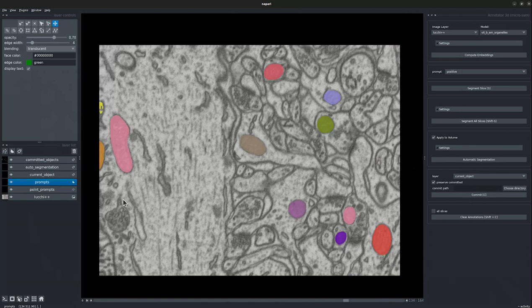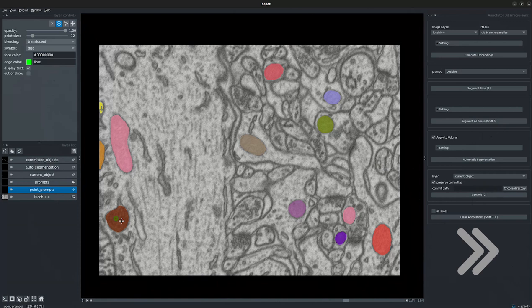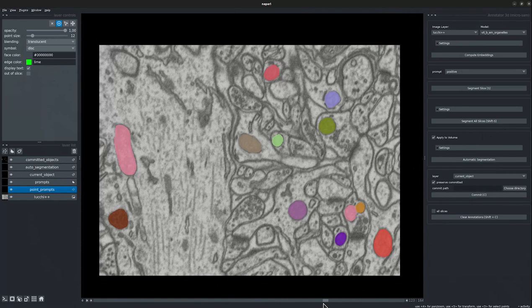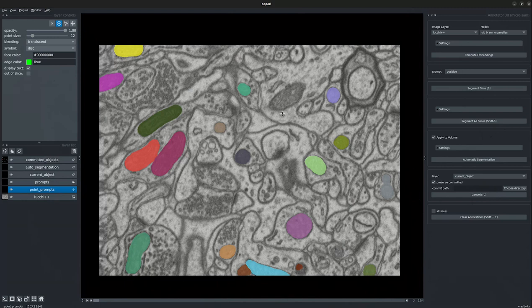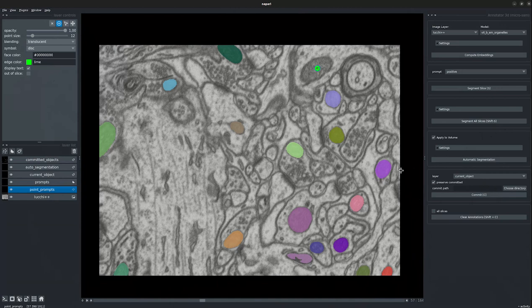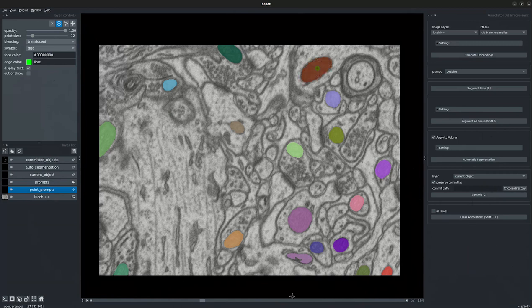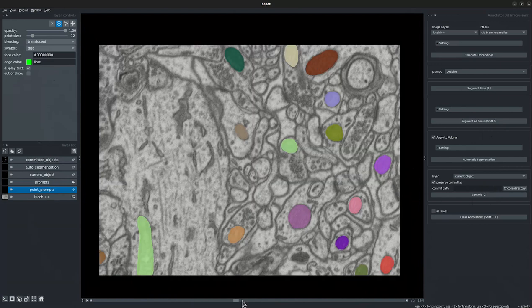Now let's choose another object. Let's go ahead and choose point prompts to put a positive point prompt on the object and segment it along all frames. There we have the object segmented along all the frames. Now let's commit this segmented object. Now let's segment the final object which is missing along all the slices. Let's choose a middle slice, put a positive point prompt on the object, and segment all slices. We see that the segmentation has taken place for all the slices. Segmenting this object roughly takes under 30 seconds.